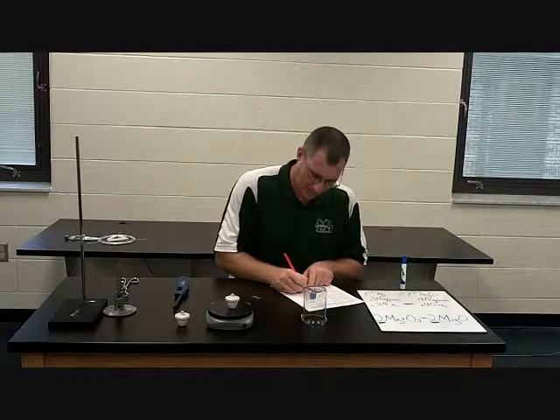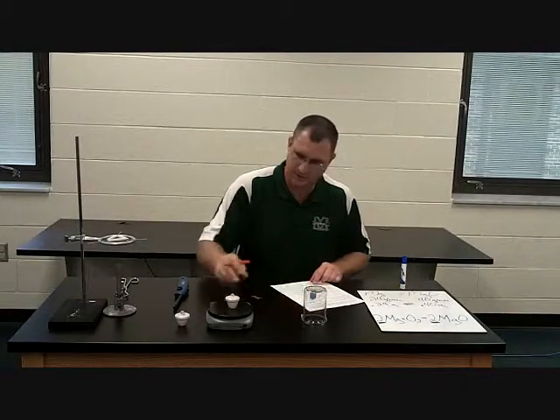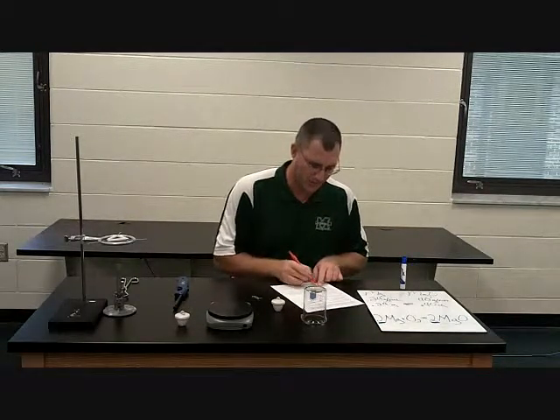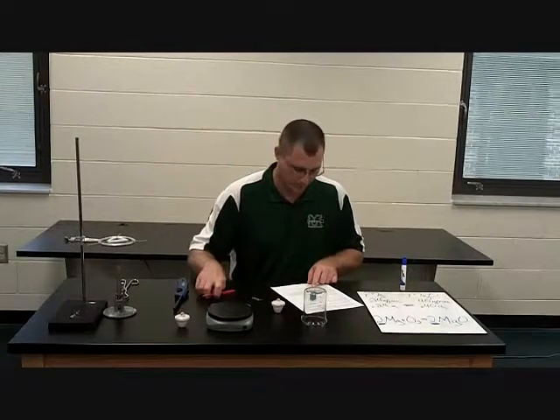So I've got 0.24 grams of magnesium. I've got 19.60 grams for my crucible and lid. Now if I want to cheat a little bit, I can look down here and it says total mass before, and I'm going to write in, I want to add those together, and it's 19.84 grams. That's my magnesium and my crucible.